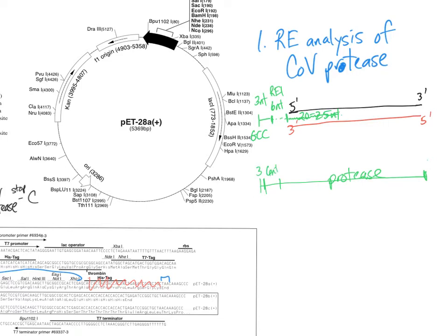The bottom strand is a little different in that what we're going to do is, again, we're going to copy that top one now. So it's going to look similar to this, the top, but it's going to look like the bottom strand. And it's going to have 20 to 25 here. That it's going to essentially mimic the bottom strand, remembering that the 5' is this end. And this is the end of that primer. And so what we're going to end up getting is, right, a bottom strand as well.